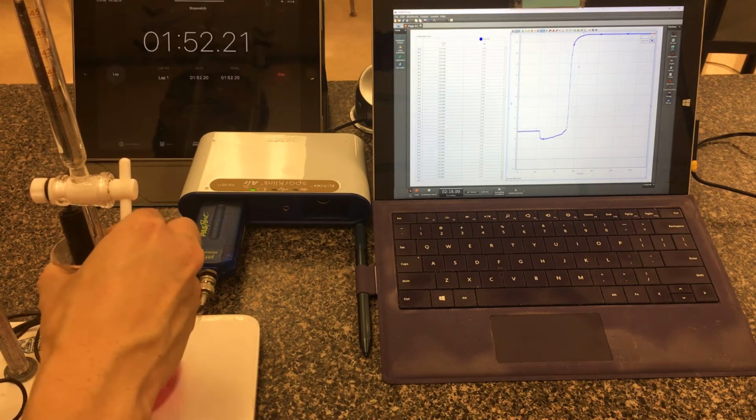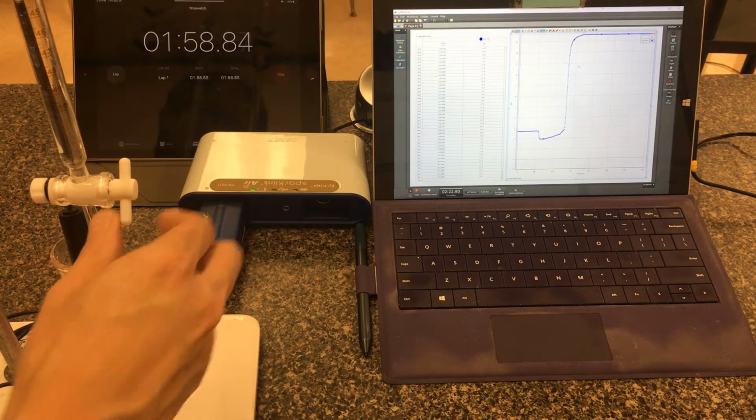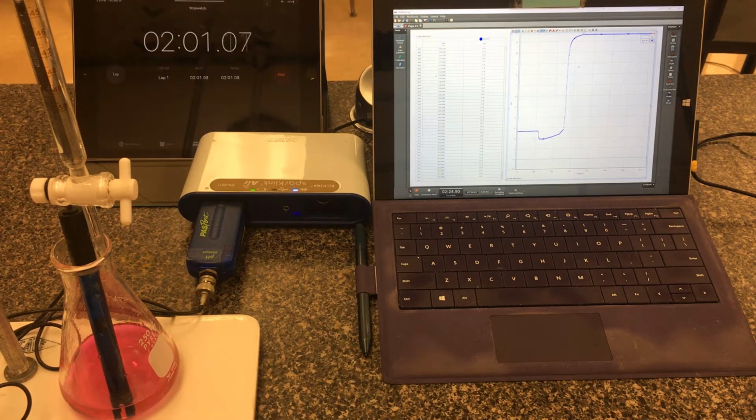Again, this is sort of just giving you a feel of what's going to happen here. We'll do it once more, a little bit more accurately later on. Okay. I'll just let in the last 10 mils of base fall in there. I've noticed that this is going drop-wise. There's actually a device called a drop counter.